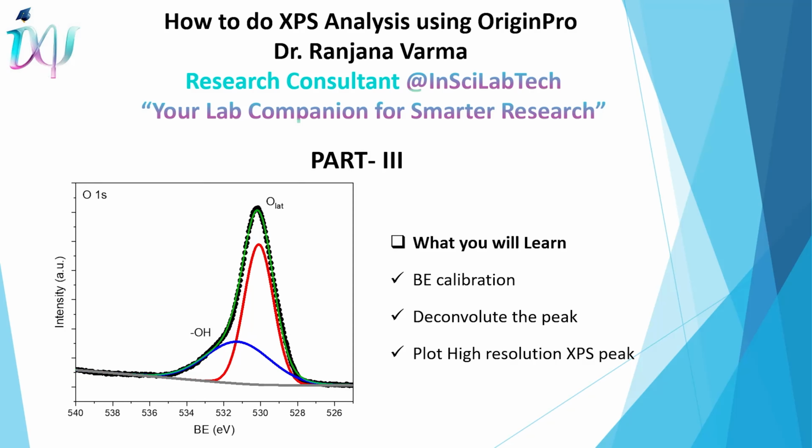As part of our For Researchers by Researchers initiative, I'm here to show you how to perform XPS analysis using OriginPro. I have divided XPS analysis into three parts for clarity and accuracy. This is part 3 of the XPS analysis series.